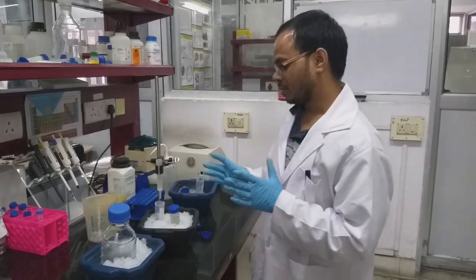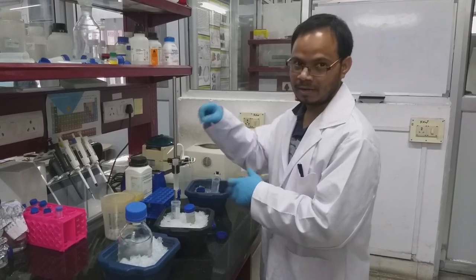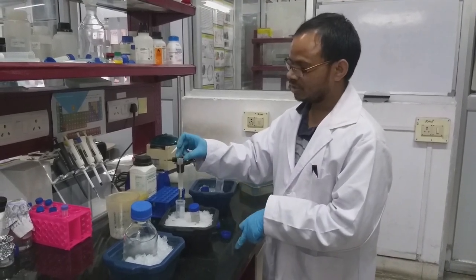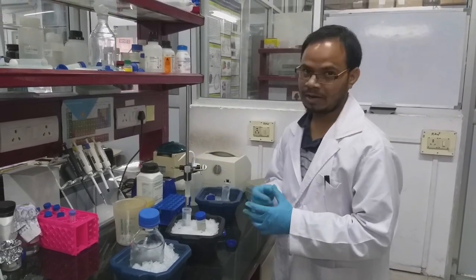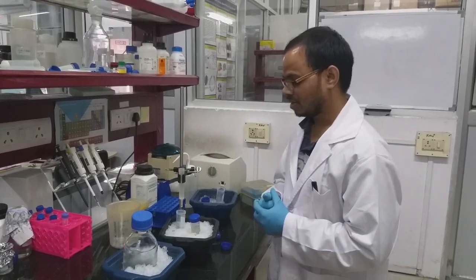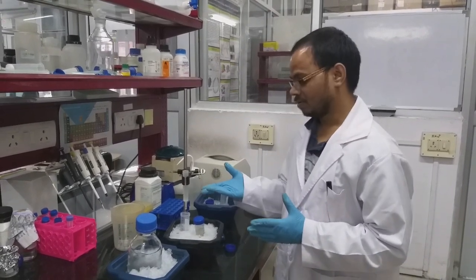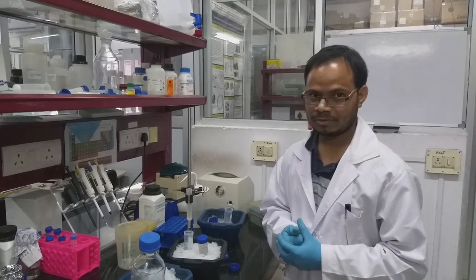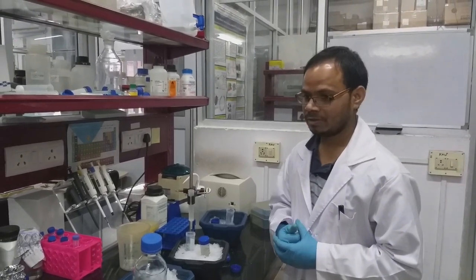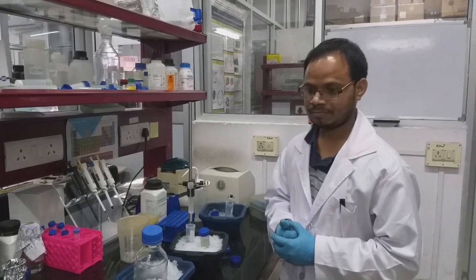Before doing this, we have to observe the beads. We should not directly load onto the beads. You just have to pour through the corner, through the wall of the column. Otherwise, it may disturb the beads, so the protein may also degrade. So this we have to keep in mind while doing this washing.